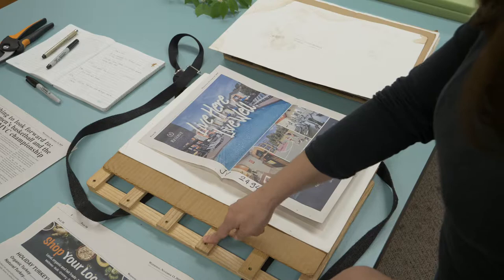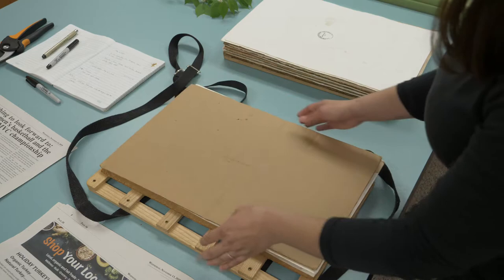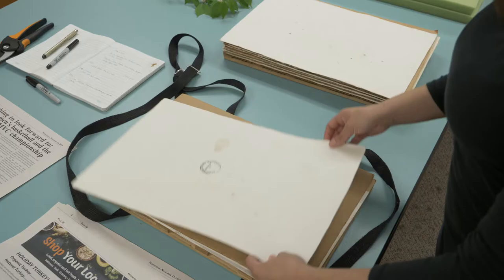This is how you put it in the press. You put first the frame, then you go with your corrugate. You have a piece of blotter, then your specimen, and again another piece of blotter, and another corrugate. And that's it — you're ready for the next plant.